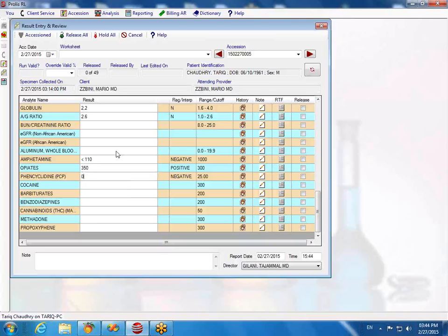Let me enter 0. Okay, so it's 1. The sensitivity is 1, yes. It is handled automatically, okay? Yeah, very nice. So you'll have to enter all those values in here.